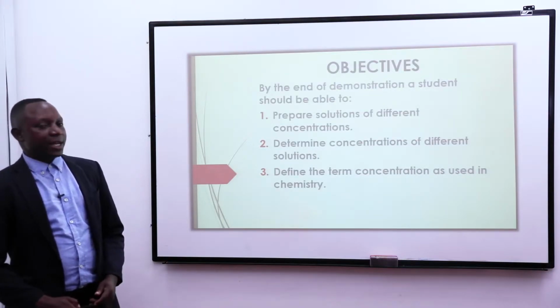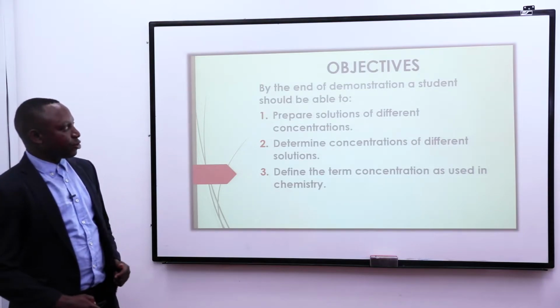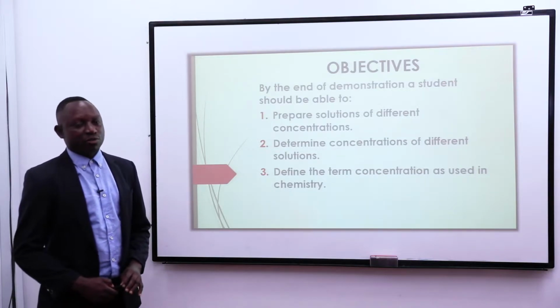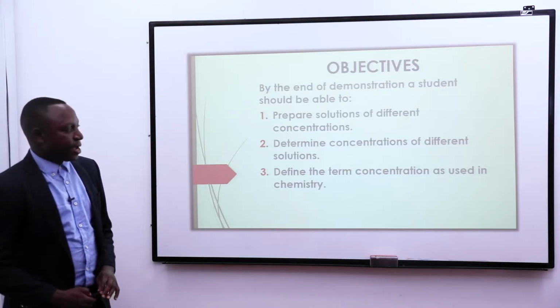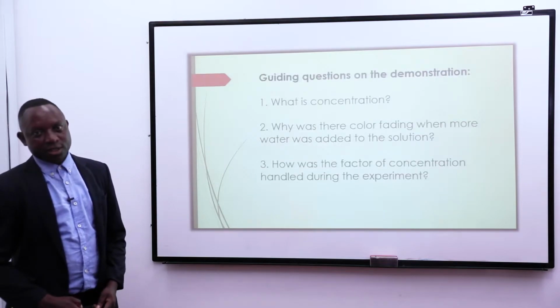The objectives of our lesson are that by the end of the demonstration, a student should be able to prepare solutions of different concentrations, determine concentrations of different solutions, and thereafter define the term concentration as used in chemistry.